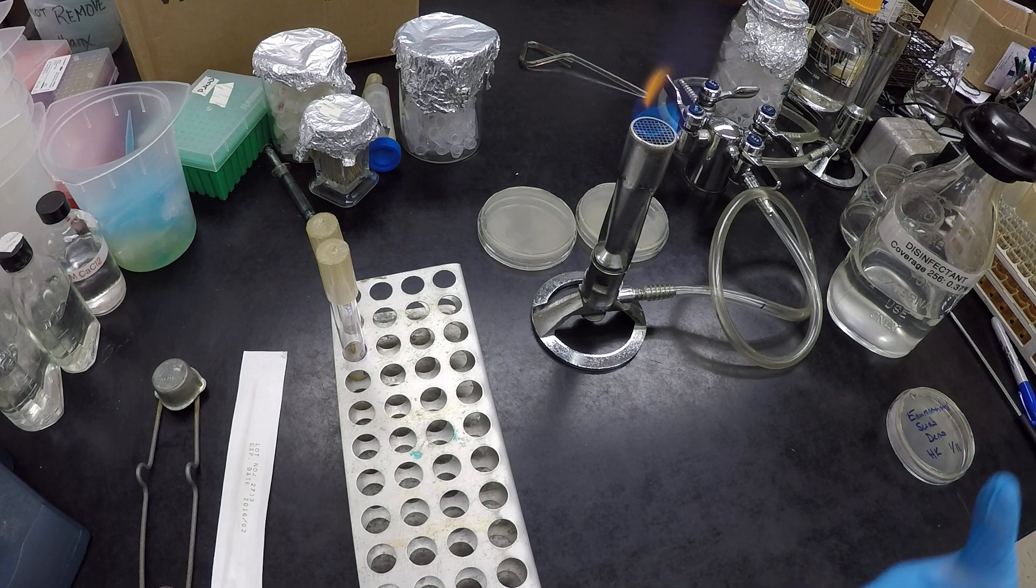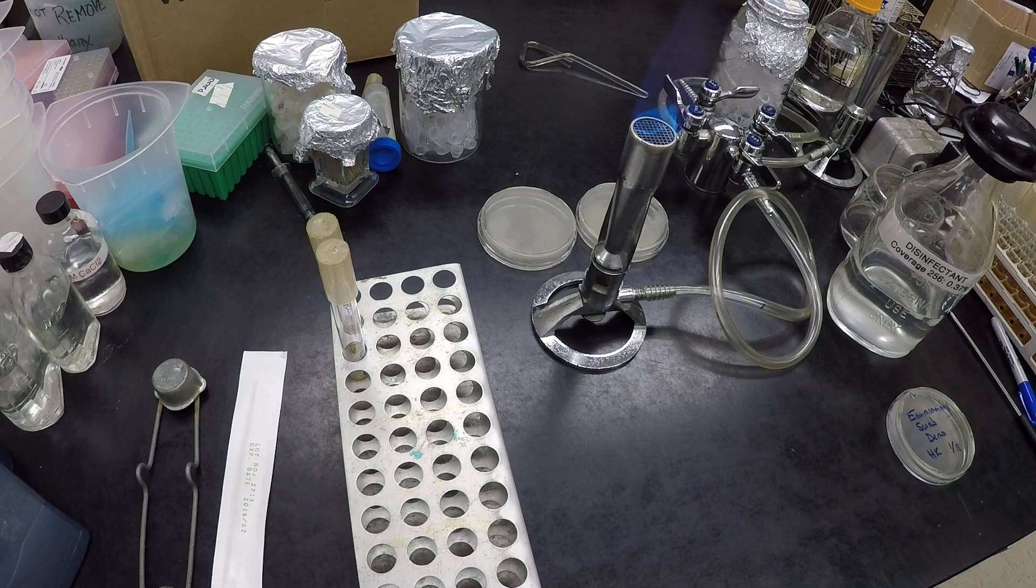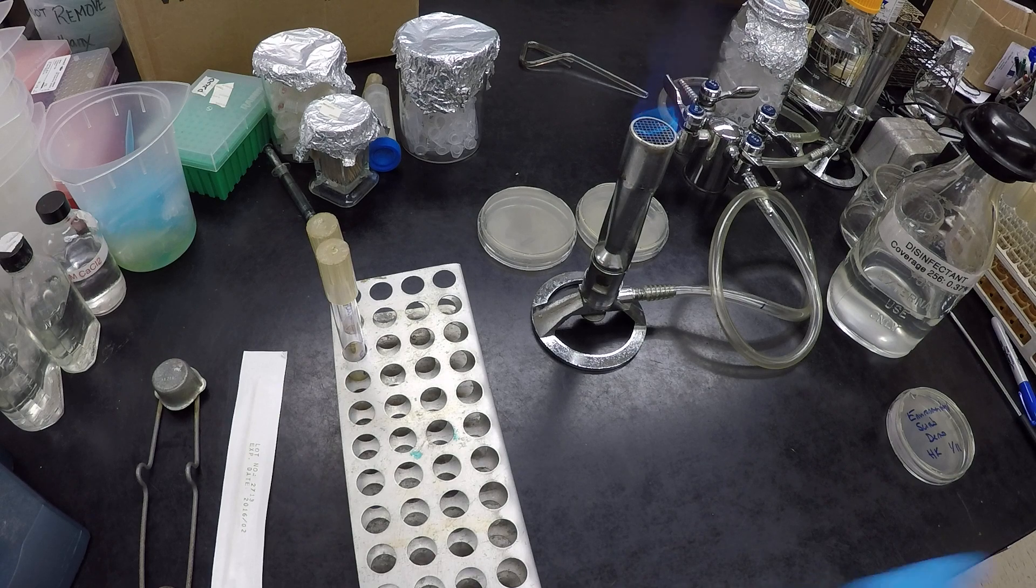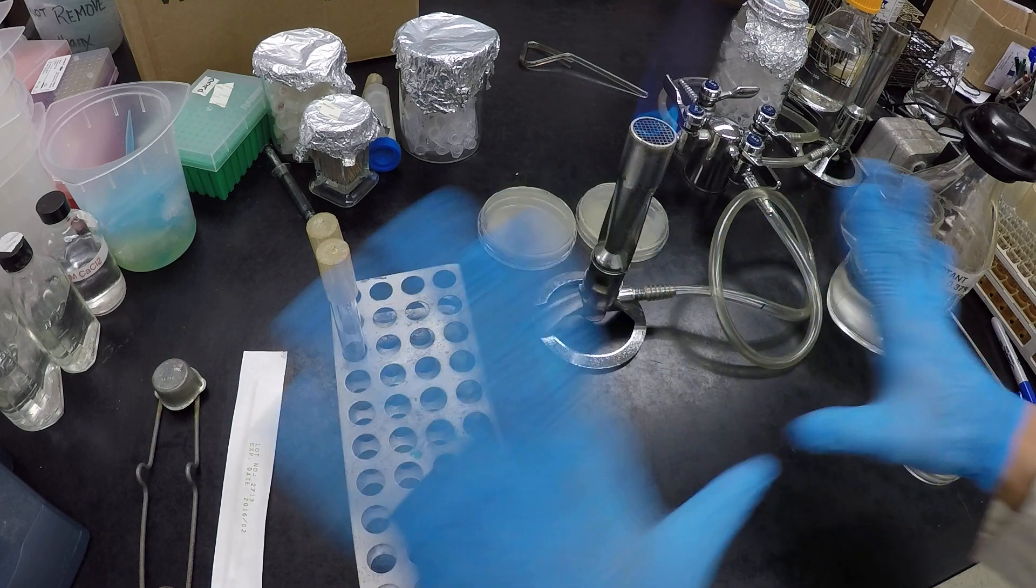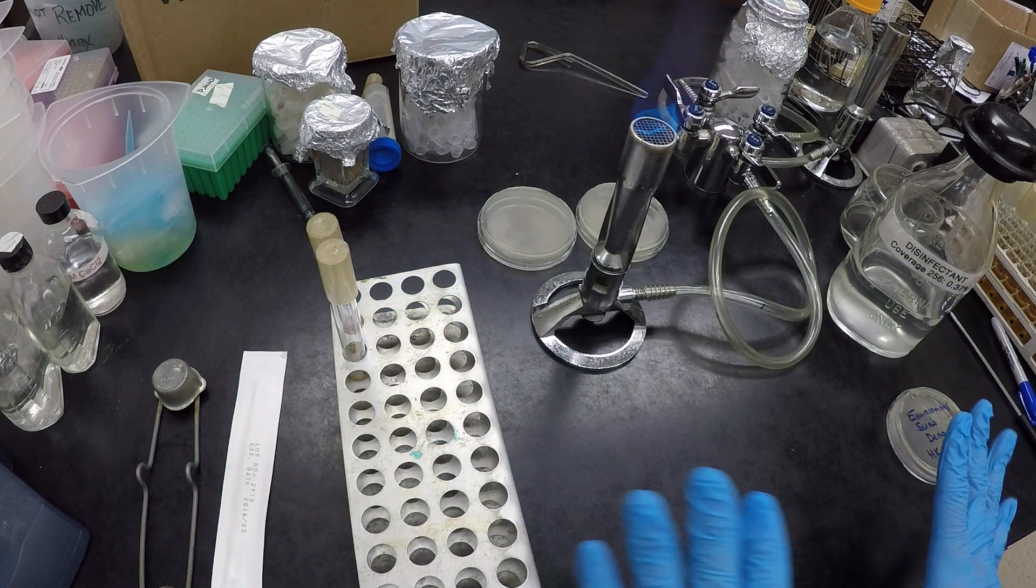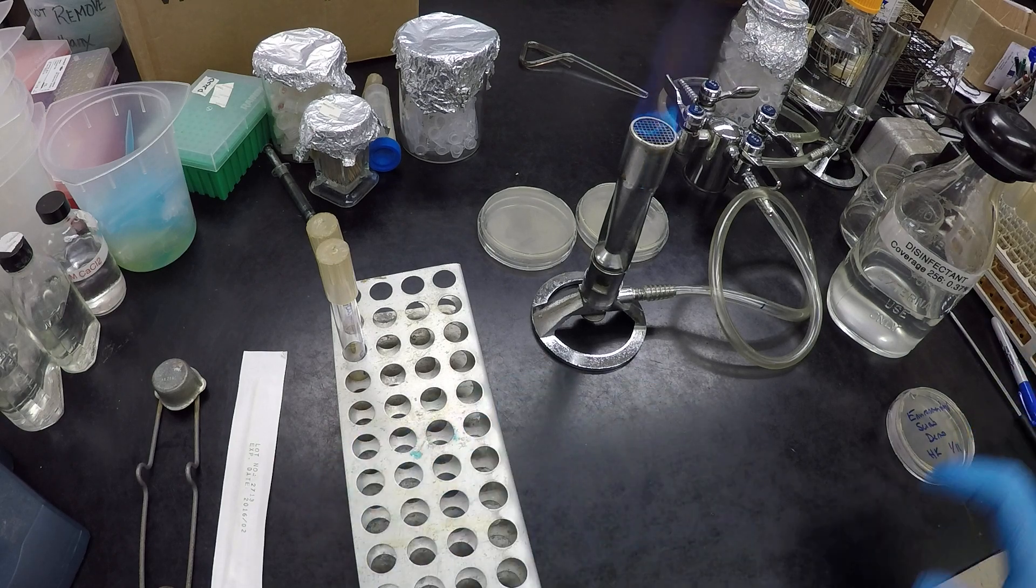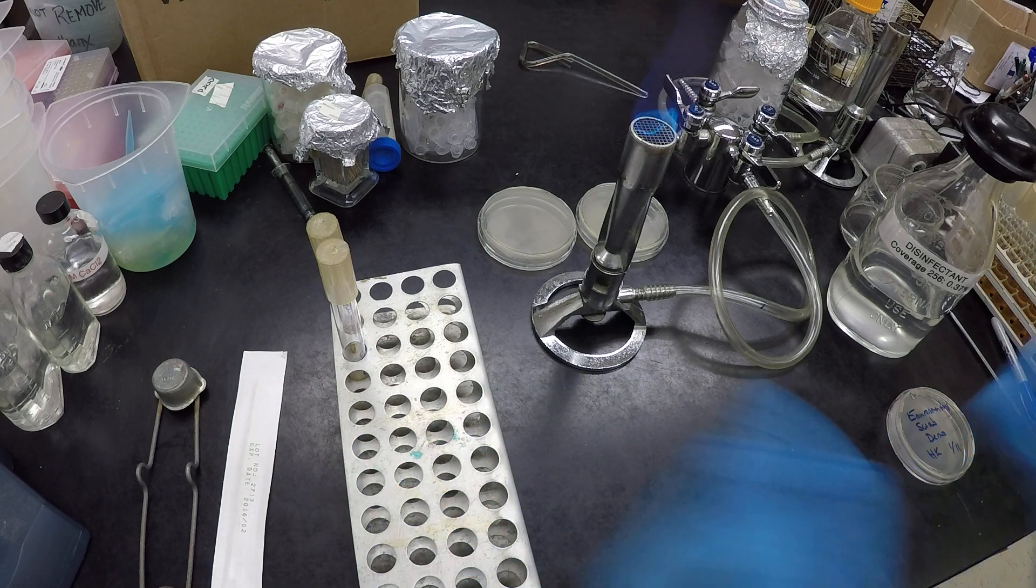So when we're growing certain bacteria, it's only the bacteria that we would like to grow are capable of growing. Source of contaminants come from a number of places. First and foremost, it's the environment. The environment around here is dirty, and you will find out that bacteria are everywhere.